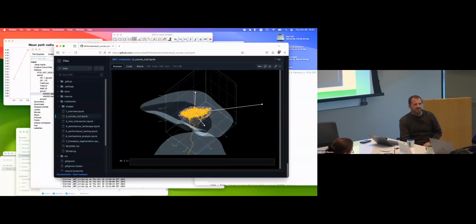And then the debugging is kind of, so the auto completion is nice, that was pretty much all of it, but the debugging is bad. I did that part. And so basically when you have a line that errors, the script editor populates all sorts of stuff before with add parameters and all that. So there's like a huge offset. And sometimes for Python, that thing never works very well. So it tells us line 20, but it's actually line 14. So that can get on your nerves quite a bit, easily. Groovy was awesome. Groovy is nice because it errors, tells you which line, and even suggests, are you sure you didn't mean to do something else? But it doesn't have auto-completion.